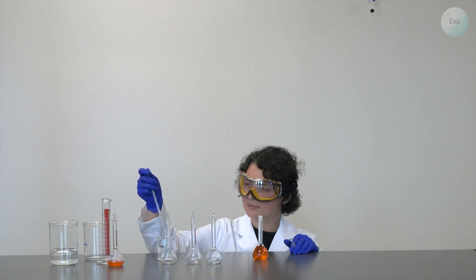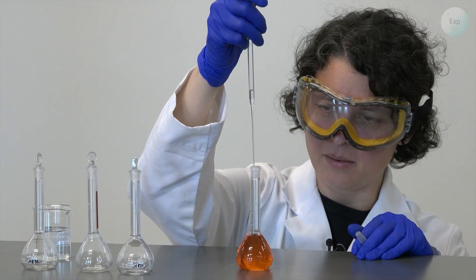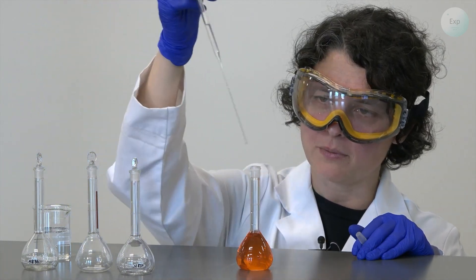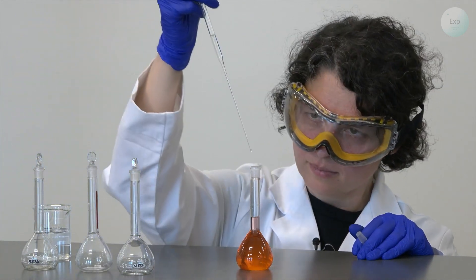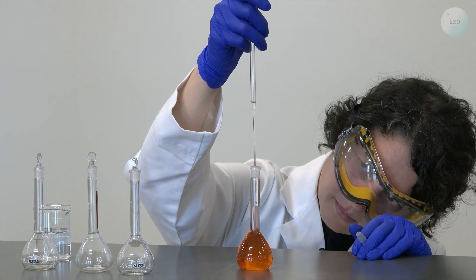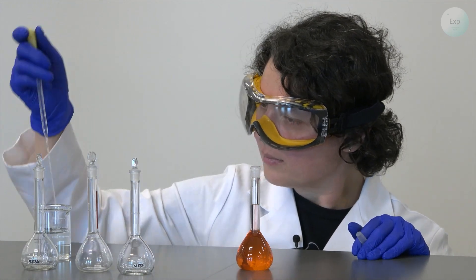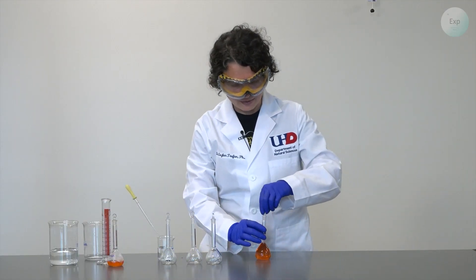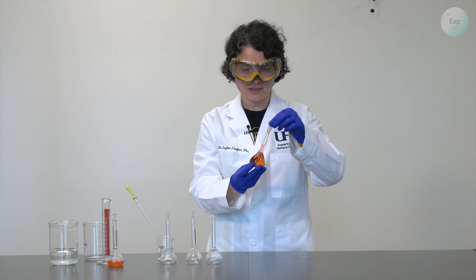We take our pipette, draw some water, and then make sure that we complete the volume of our solution all the way to the 50 milliliter mark. The meniscus of my solution is exactly at the 50.0 milliliter mark. Now I homogenize my solution.